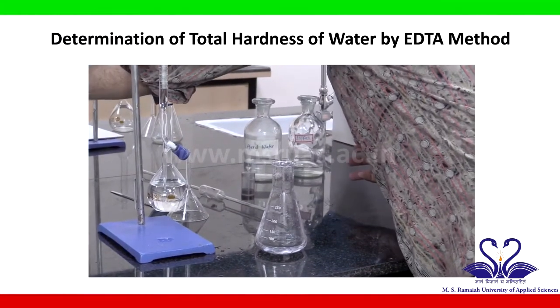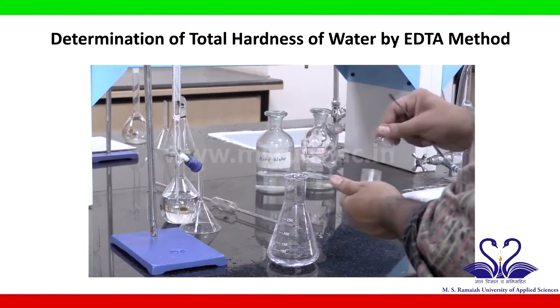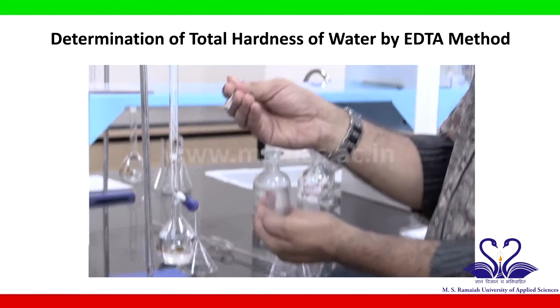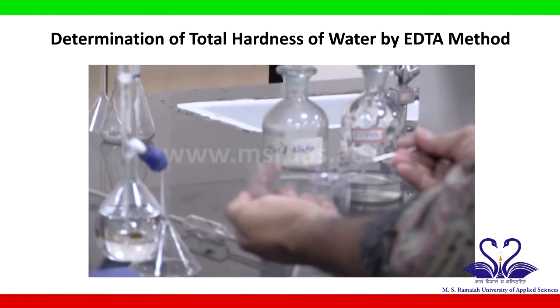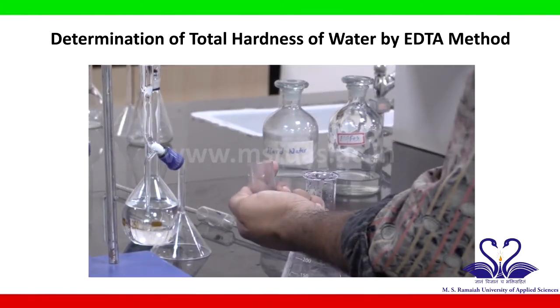Now we have to add the indicator. A pinch of indicator, a small quantity of indicator to the flask.